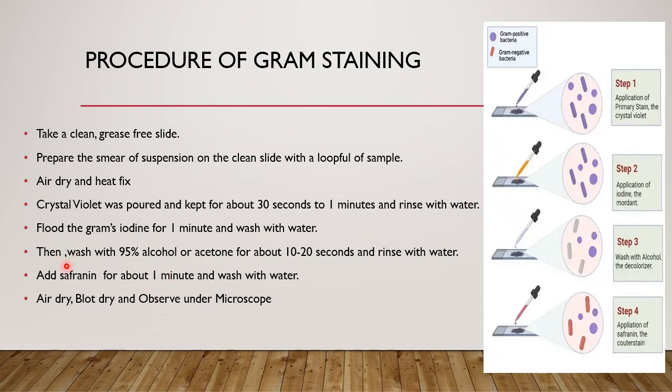After that, the second step is to flood the smear with Gram's iodine for 1 minute and wash it with water. You will take the iodine solution, again flood it completely onto the smear, keep it for 1 minute, and then rinse it with water. This is the second step.